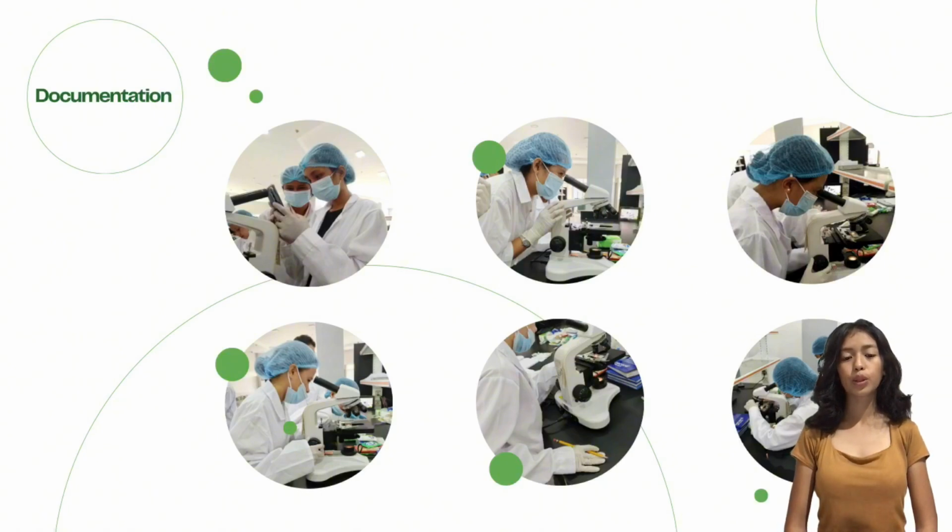During the activity, our group worked together in preparing the microscope, checking the slides, and observing each specimen. We took turns adjusting the focus, changing the objectives, and describing what we saw. We also recorded our observations by writing notes and taking photos of the slides when possible. We documented the appearance of each specimen at different focus levels, starting with its overall shape and then its smaller details. We also compared what we saw with reference images to help us identify the parts correctly.